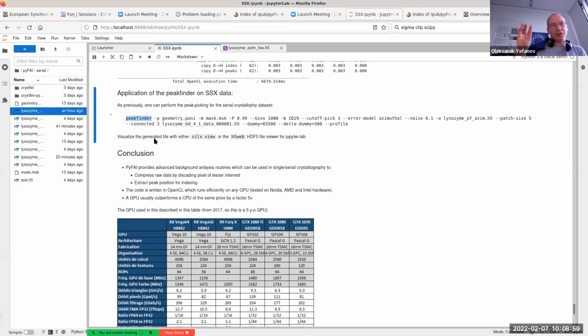Right, but each of your crystals is usually rotated in a different orientation. At least that's what people want to see, that every crystal is in a different rotation. So it will find you the same orientation. Of course, if those are two crystals in absolutely the same orientation, there is no way to distinguish them. It's physically indistinguishable. But that's a more difficult problem. Could you write down the name of the program into the chat again, please? Yeah, okay, I will. Thank you so much. You're welcome.